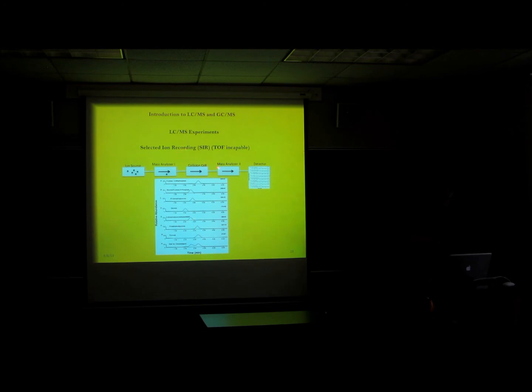The advantage of selected ion recording over doing selected ion chromatograms on a full scan is sensitivity, because your detector is sitting there looking at ions of one mass to charge the entire experiment. You're not missing M/Z 459 while M/Z 850 is being transmitted through the quadrupole.